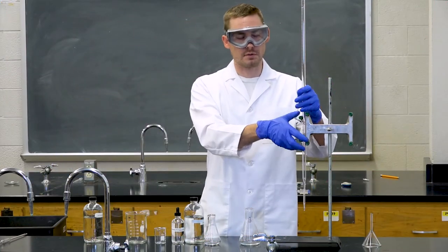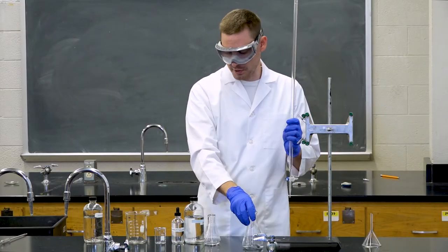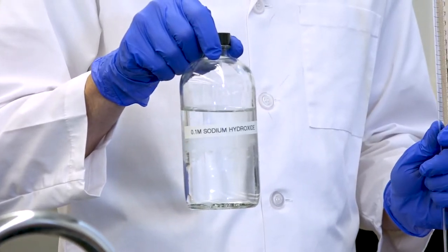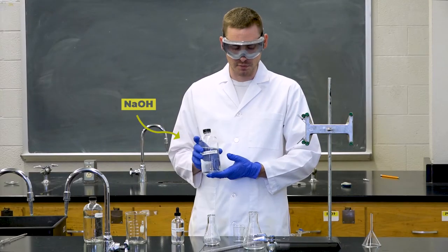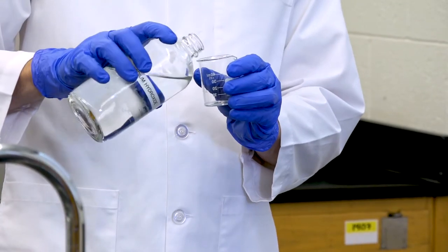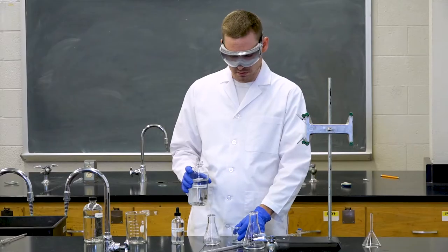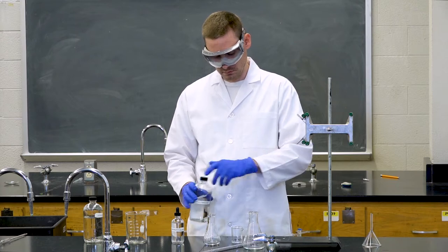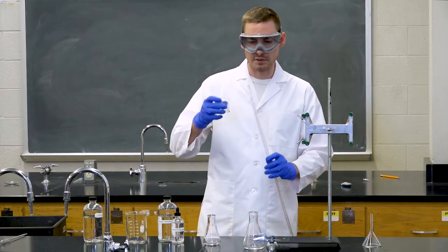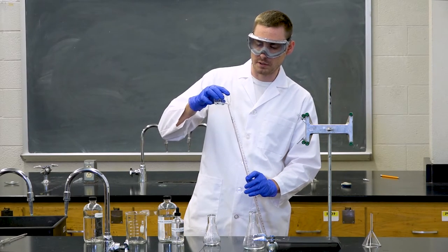Next, we're going to need to rinse the burette with our basic solution. So for this first experiment, we're going to be using 0.1 molar sodium hydroxide. And once again, we don't want to add it to our solution with the stock bottle in case we spill it. So we're going to first put it in a small beaker. To rinse the burette, we only need maybe 10 milliliters. You need to make sure the valve is closed, and then you can add the solution to your burette using the beaker or using a funnel.